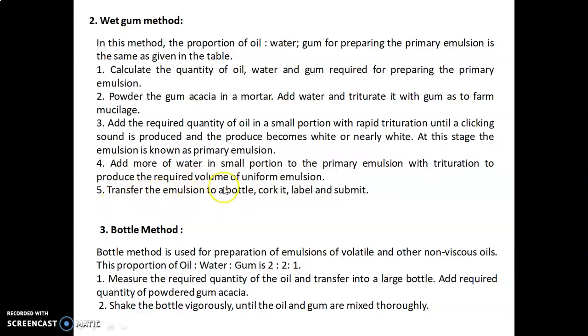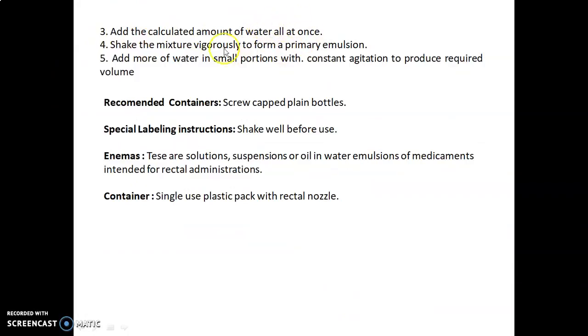Bottle method is used for preparation of emulsions of volatile and other non-viscous oils. The proportion of oil to water to gum is 2:2:1. Measure required quantity of oil and transfer into a large bottle. Add required quantity of powdered gum acacia. Shake the bottle vigorously until oil and gum are mixed thoroughly. Add the calculated amount of water all at once. Shake the mixture vigorously to form primary emulsion. Add more water in small portions with constant agitation to produce the required volume.